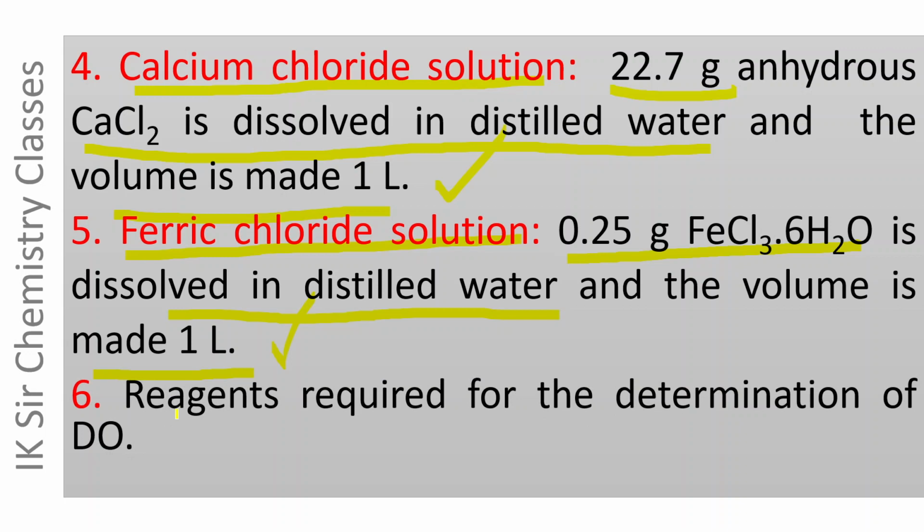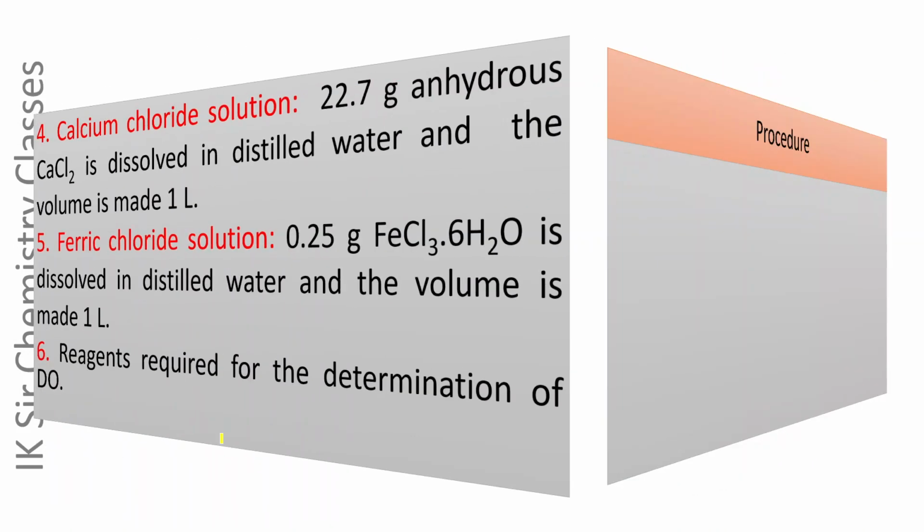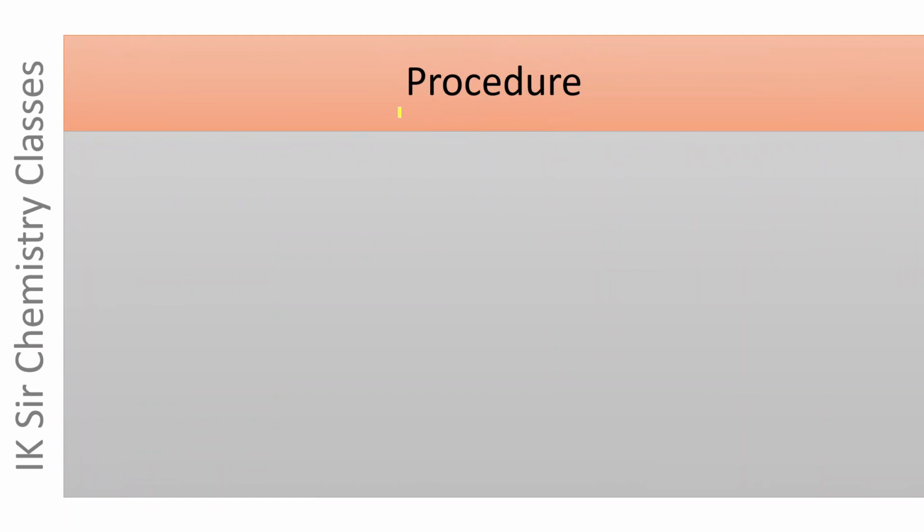And reagents required for determination of dissolved oxygen are required. It has been discussed in the previous video. And now let us see the procedure for the determination of BOD of a water sample.